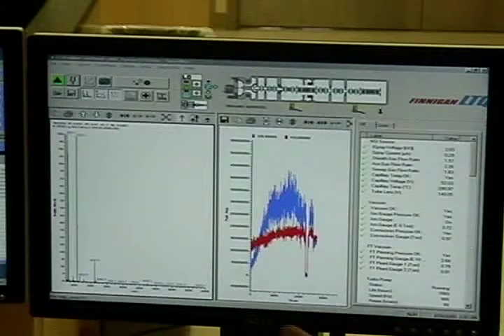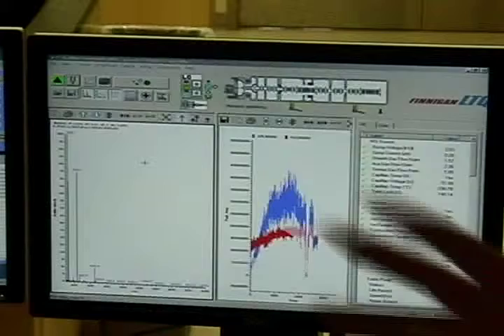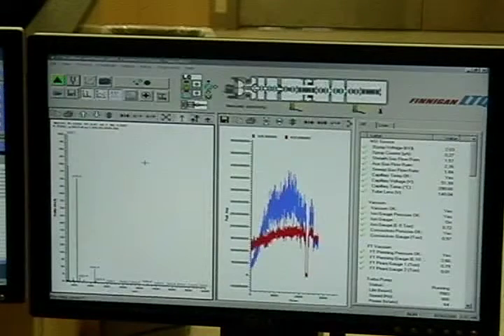So do we want to go back to 250? And do you want to save 3 tune files and try to run them and see what happens? Do you want to save like a 290, a 250, and a 200? Or the capillary temperature, and do you want to try different tube lenses? It's up to you how many samples you want to sit running for 3 hours. Those ones you can automate. Why don't we try like 250 at 2 different tubes and a 200 file?